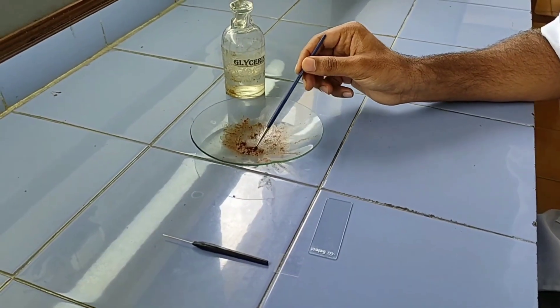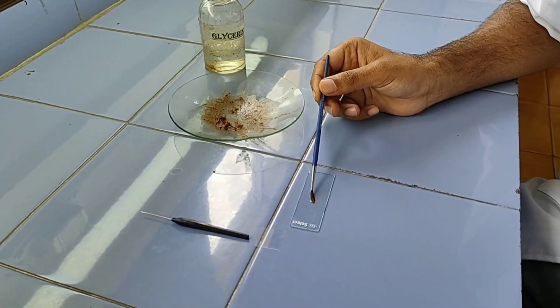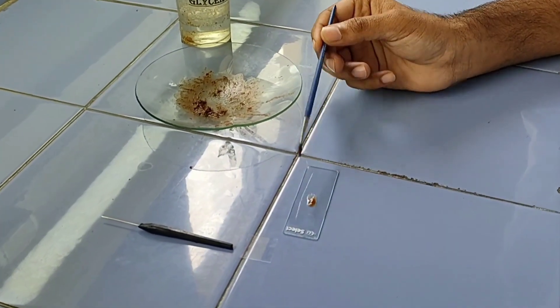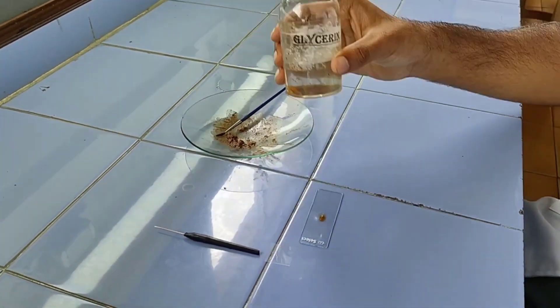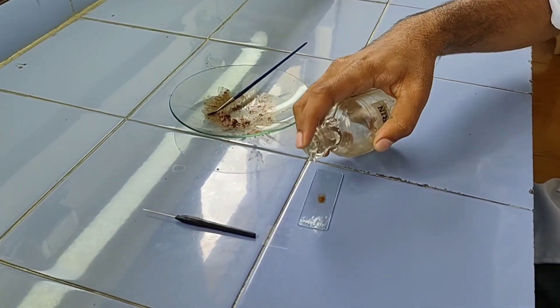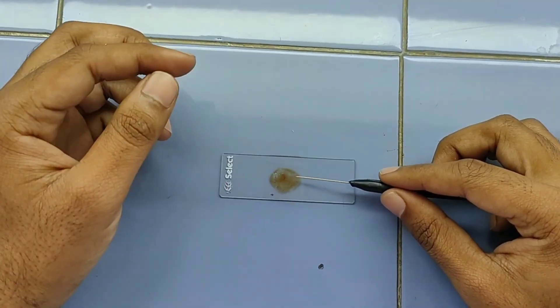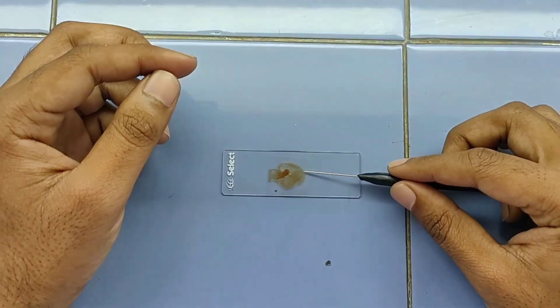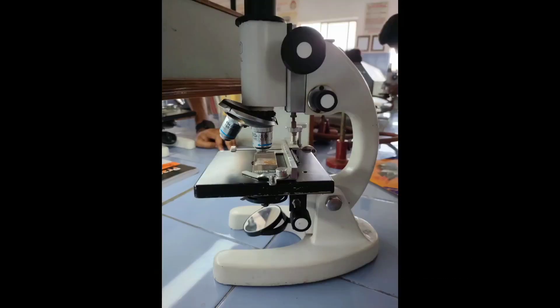After preparing the sample, carefully mount it on a plain slide and add a drop of Glycerin. With the help of the needle, place the cover slip and observe that there are no air bubbles. Then observe under 10x.